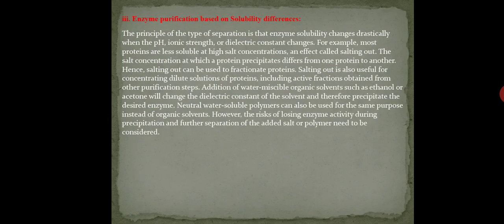In this lecture we are going to discuss enzyme purification based on the solubility differences. In the last video we showed enzyme purification based on molecular size and enzyme purification based on charge. Now in this lecture we are going to see enzyme purification based on the solubility differences.